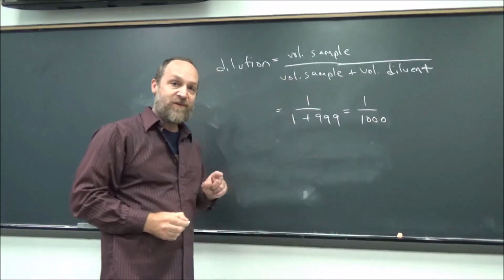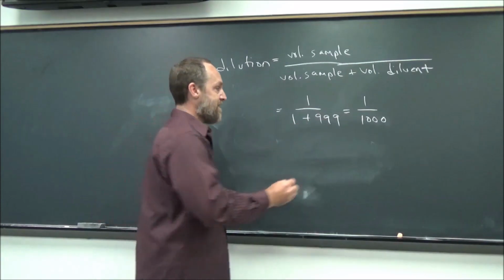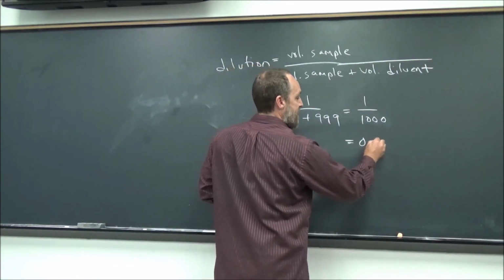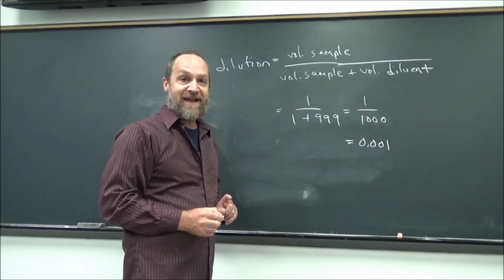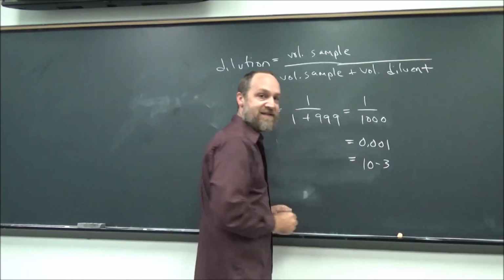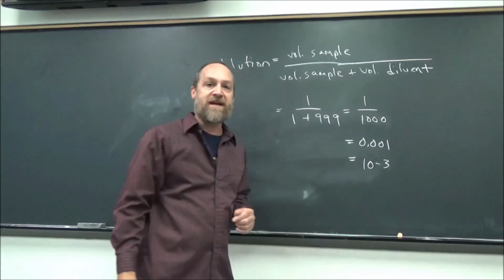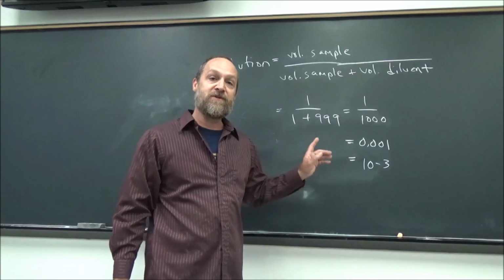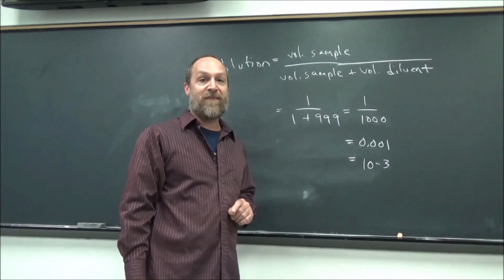Okay, but you should be able to work with decimals and exponents as well. So 1 over 1,000, if you just put it in your calculator, you get 0.001. You can also express it as an exponent, and that's 10 to the minus 3. You would move the decimal place 3. Okay, so we've got all this in the handout. Be prepared to do the dilution calculation. Be prepared to determine the colony forming units per milliliter.